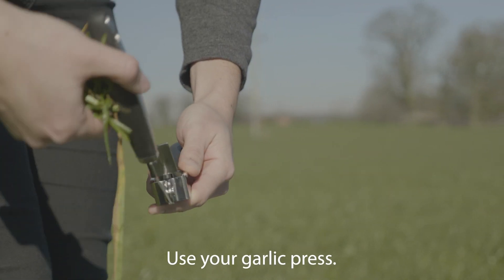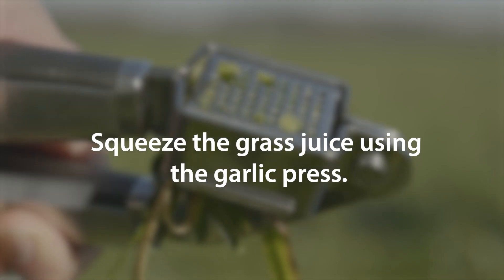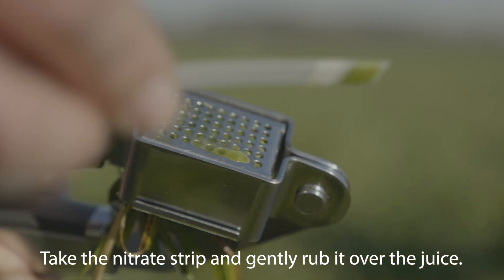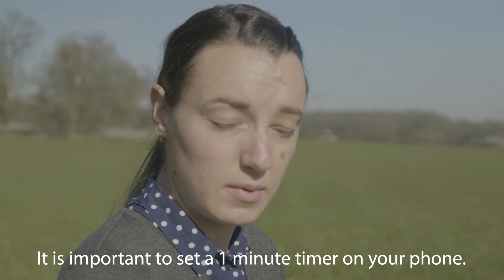Use your garlic press. Take the nitrate strip and gently rub it over the juice. It is important to set a one-minute timer on your phone.